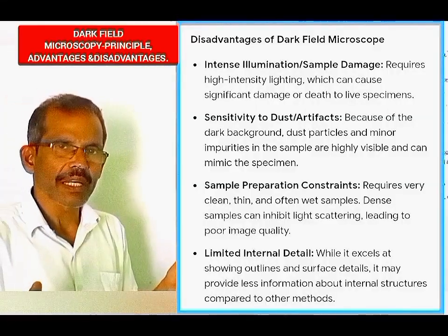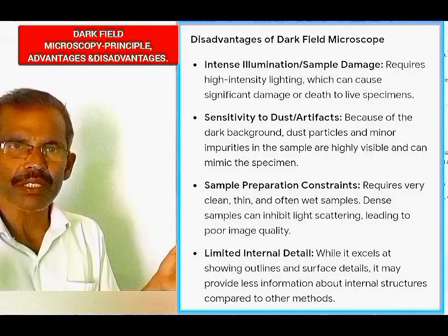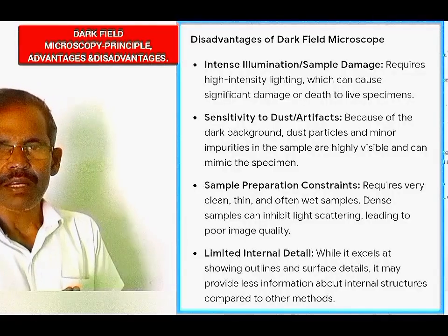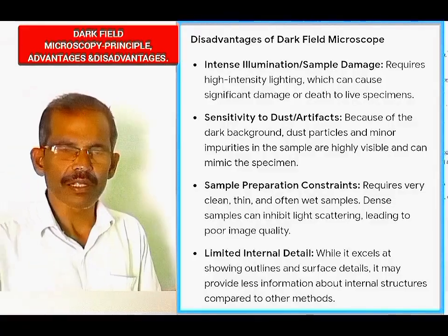Dense samples can inhibit light scattering, leading to poor image quality. Finally, this technique provides limited internal details.